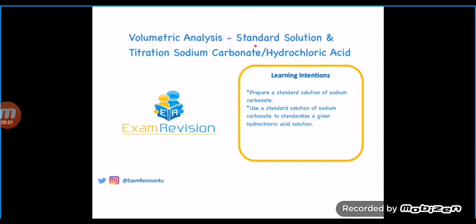Specifically, we're going to look at how to make a standard solution, and we're going to look at our titration of sodium carbonate and hydrochloric acid. So our learning intentions are to prepare a standard solution of sodium carbonate and to use a standard solution of sodium carbonate to standardise a given hydrochloric acid solution.